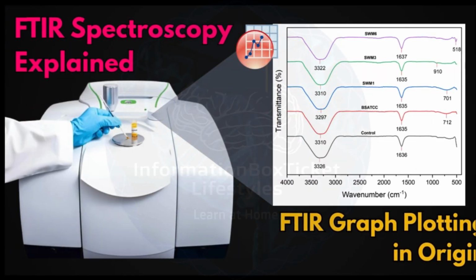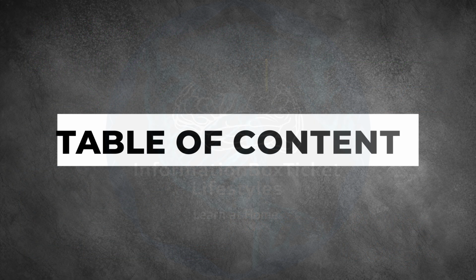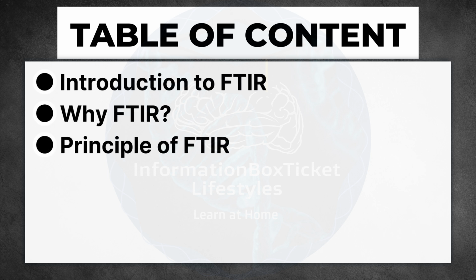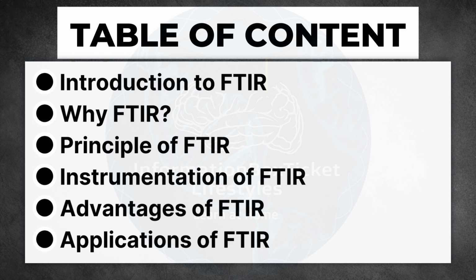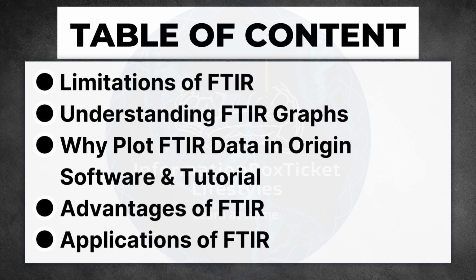FTIR Spectroscopy and Graph Plotting Tutorial. Table of Contents. Introduction to FTIR. Why FTIR? Principle of FTIR. Instrumentation of FTIR. Advantages of FTIR. Applications of FTIR. Limitations of FTIR. Understanding FTIR graphs. Why plot FTIR data in Origin software?